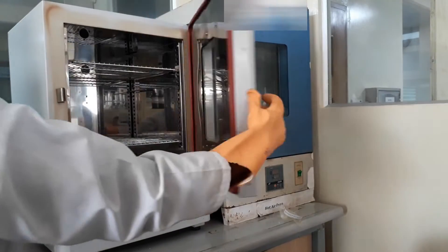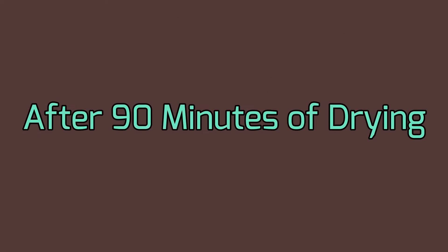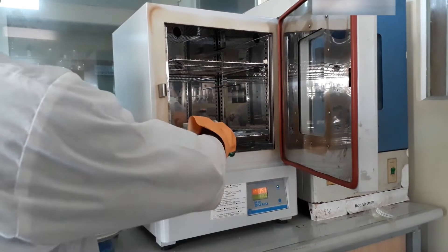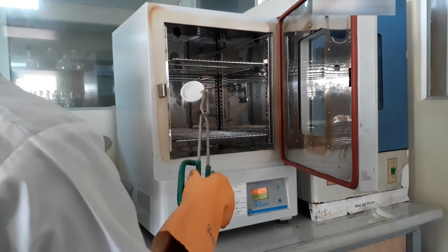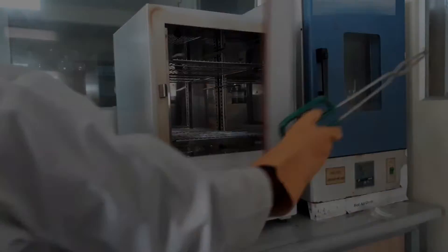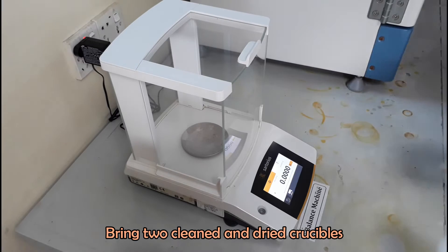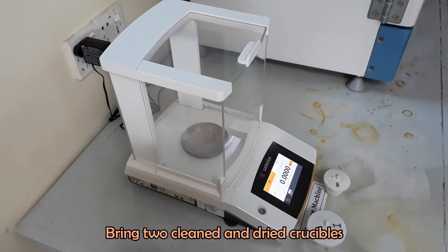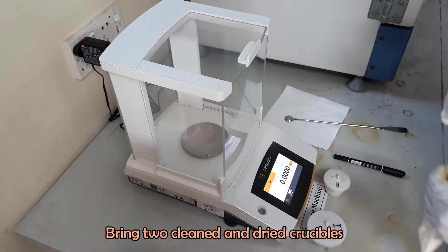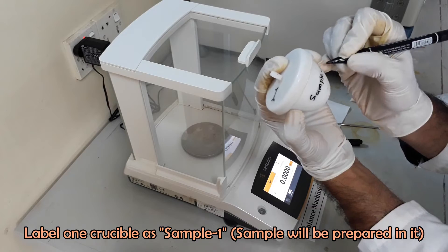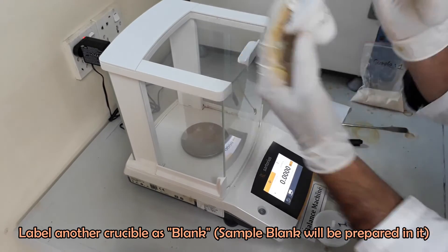Now dry the crucible in hot air oven for 90 minutes. In this step, we will burn our sample to make ash. Bring two properly cleaned and dried crucibles. Label one crucible with sample ID. We will prepare sample in it. Label another with blank.